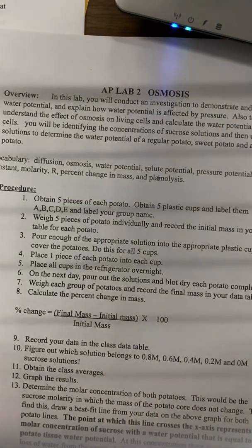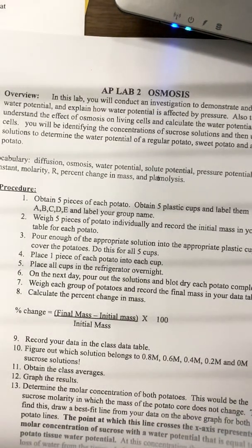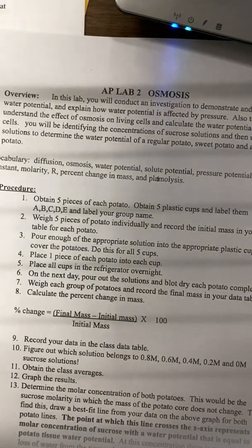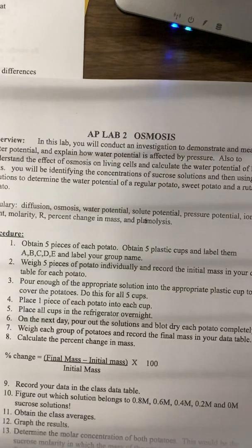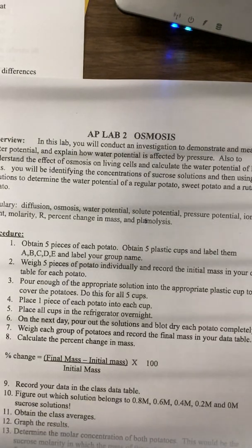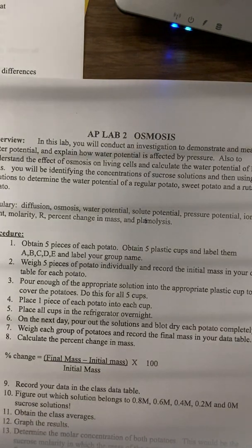Okay, after we do that, you will make a graph just like you did in the pre-lab to figure out your water potential. There is no stats technically in this lab. It's water potential calculations for this lab. You will do a CER, where you claim that this potato has the most water potential, and you would prove that with your calculations and do evidence and reasoning. You will have an error analysis, what went wrong in the lab, and a further investigation.